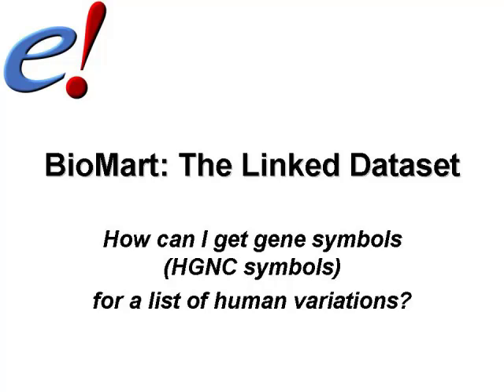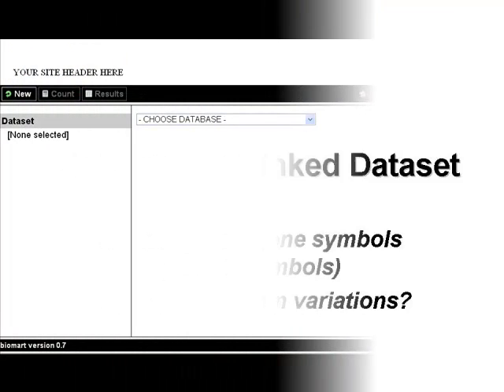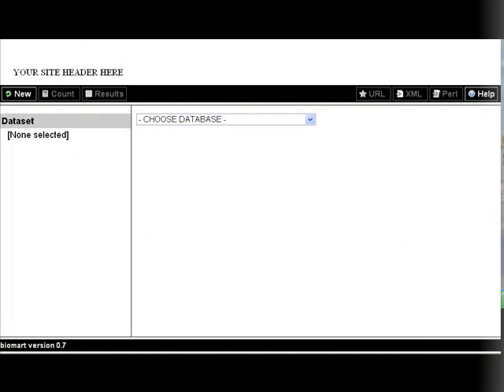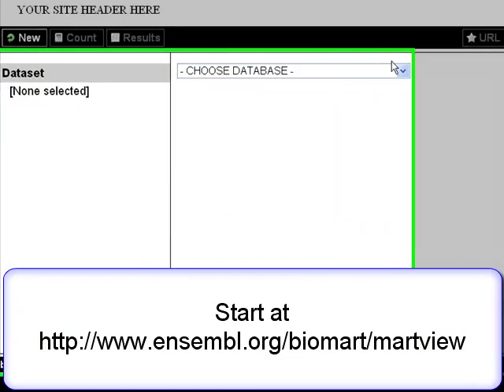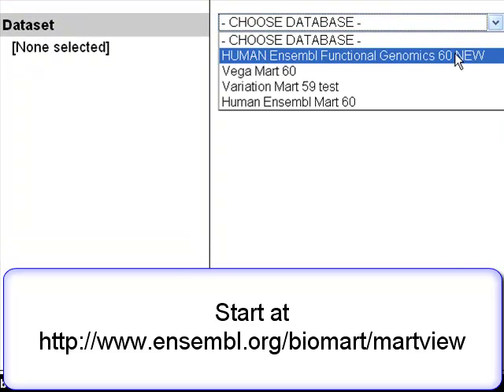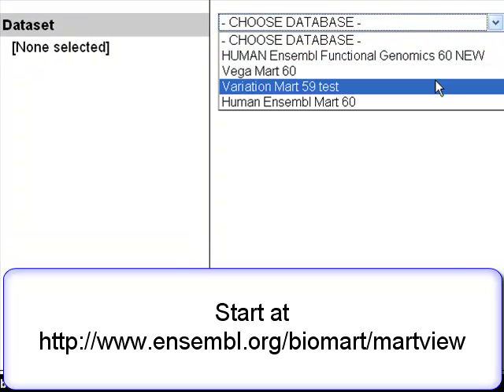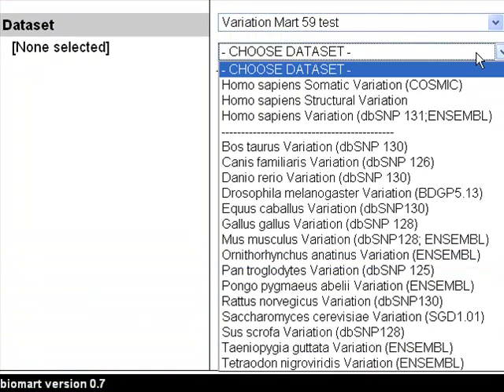I have a list of reference SNP IDs from dbSNP. Can I see the genes that are associated with these SNPs? I'll start with the Variation Mart. I'm using a test Mart for this video, so your Mart view may look different.